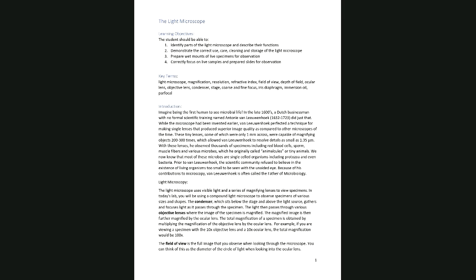But the microscopes that we use are light microscopes or bright field microscopes, so they use white light as our source of energy. We know the light source, or the illuminator, is on the bottom, and the light goes up to the condenser, which helps to gather and concentrate that light and send it straight up through the slide and through the specimen. We talked about the objective lenses, where the light comes through so you can actually see the specimen.